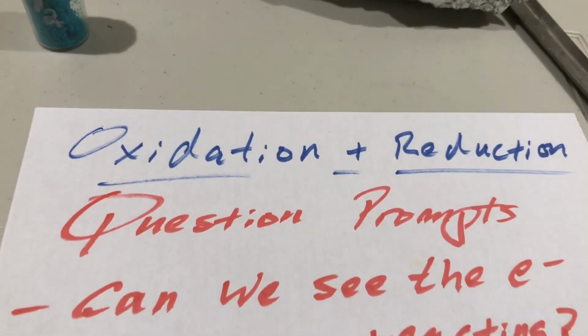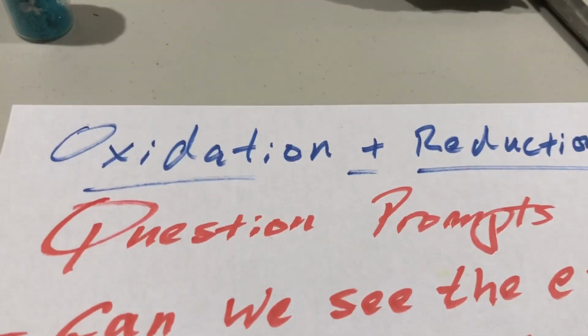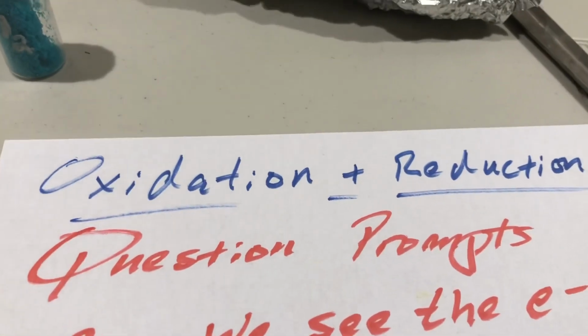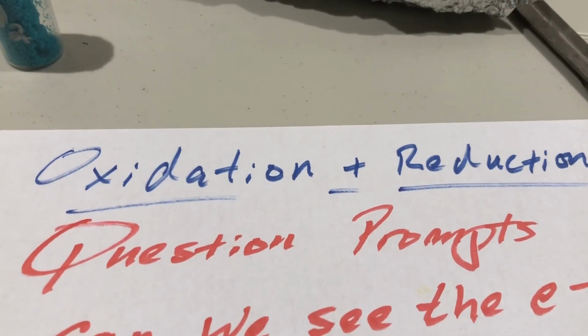Hi, this is Mr. Adams from Midwood High School, and this video is our intro demo for oxidation and reduction. I love all the chemistry topics, but I specifically like oxidation reduction because it lends itself to a lot of demonstrations to prove the points.